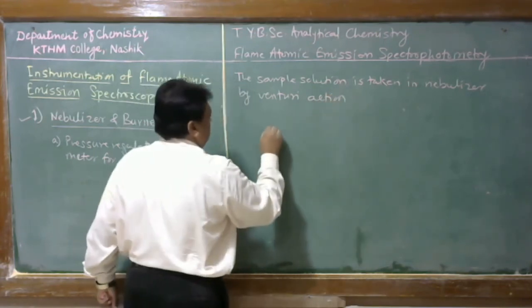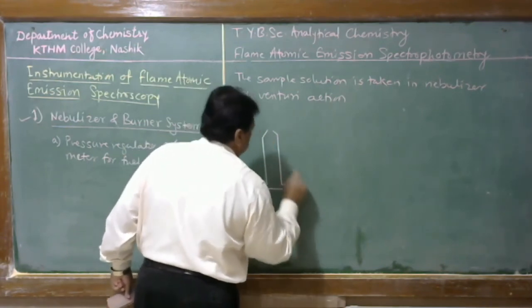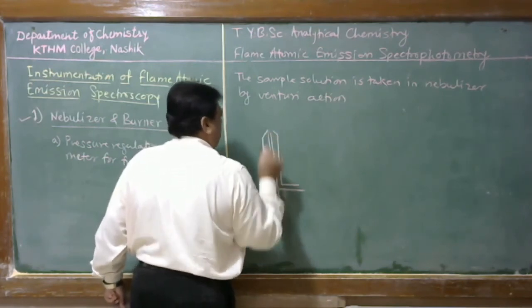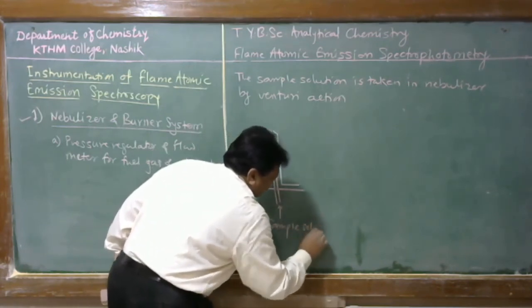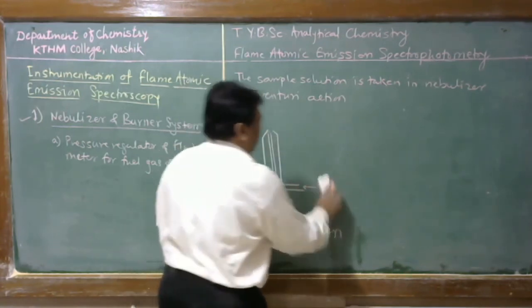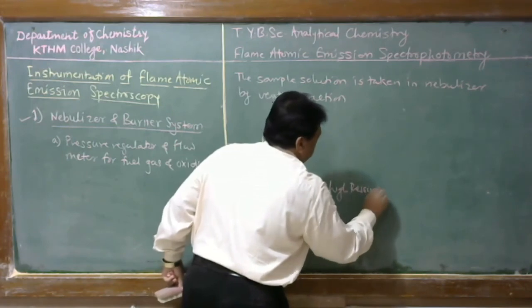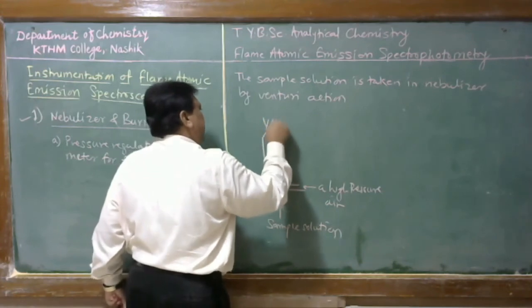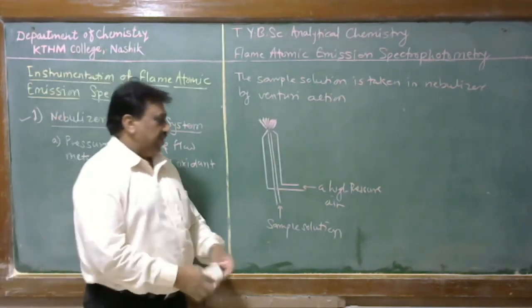Venturi action means there is a fine capillary of the sample solution, and around this fine capillary, a compressed gas flows. This is the sample solution and this is compressed air, a high pressure air or oxidant. This automatically draws the sample inside the chamber, and this effect is called Venturi action or Venturi effect.